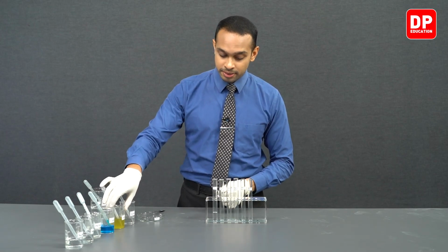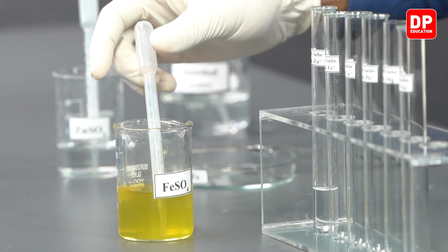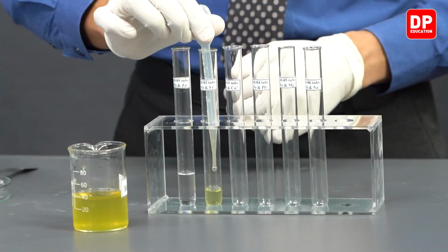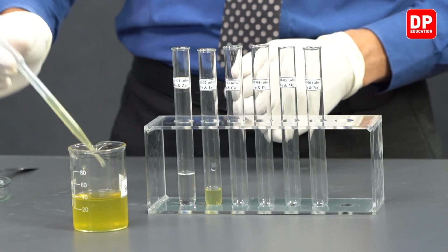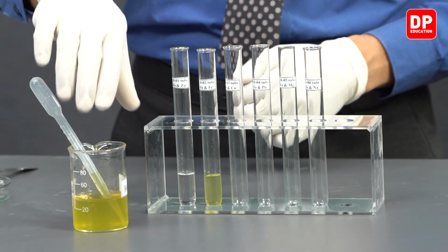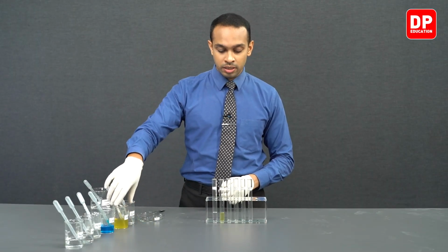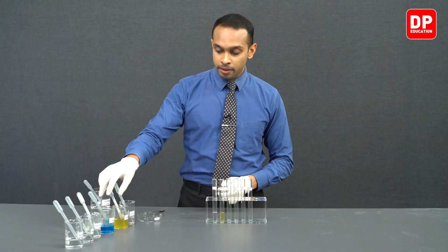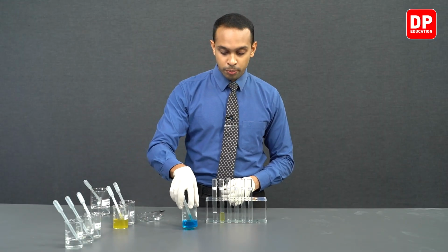And then we have ferrous sulfate. We'll transfer 5 milliliters of ferrous sulfate into our test tube over here, or the D2 test tube labeled Fe2+. We have copper sulfate.